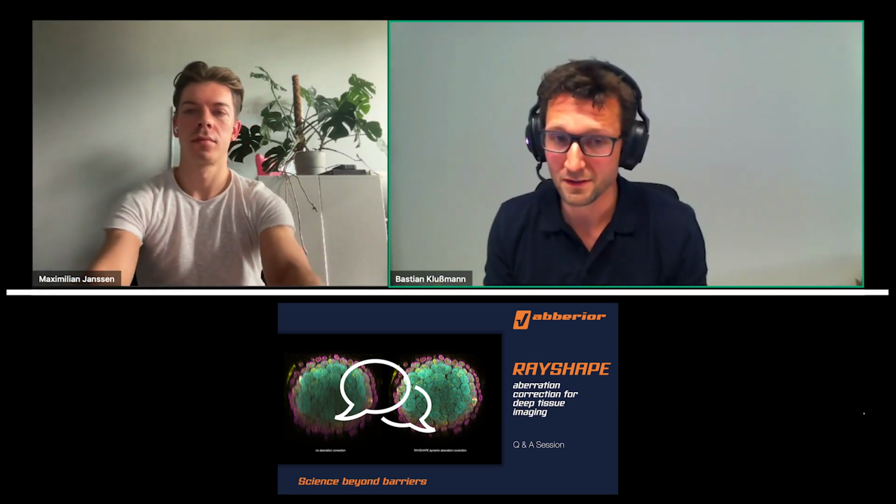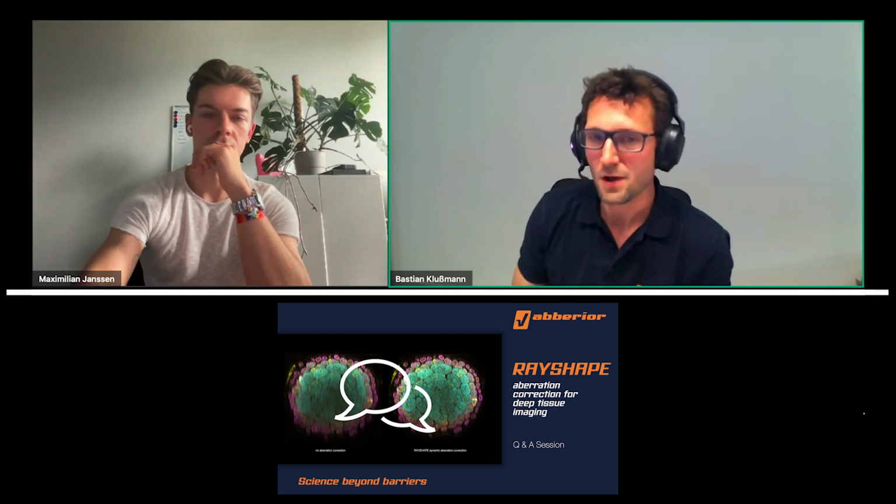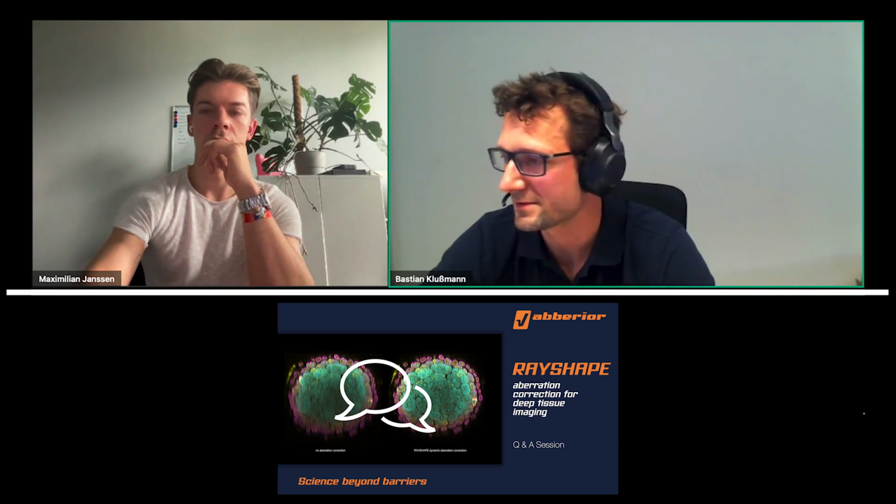No, I mean, we are specialized in STED imaging. If you try 3D STED, for example, as soon as you're in deeper sample areas, if your deformable mirror is not properly set up, you don't see anything. You basically don't have a signal. So for deeper sample areas, you have to have good settings to get a good signal out of your sample. So this is actually a pretty good metric, I would say. If you're able to do a 3D STED image in a deeper sample area, then your deformable mirror is probably set up well.